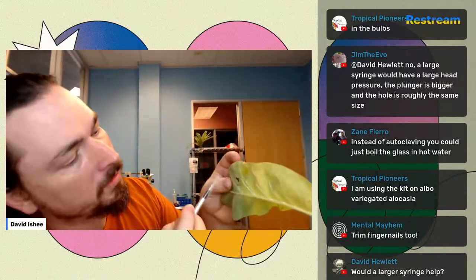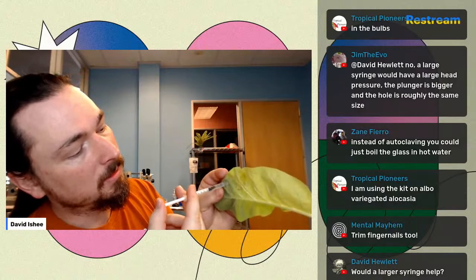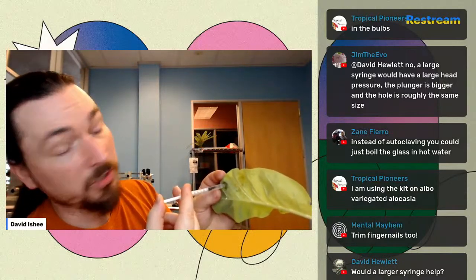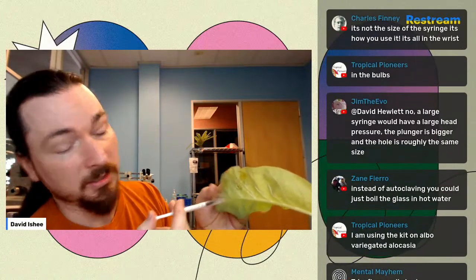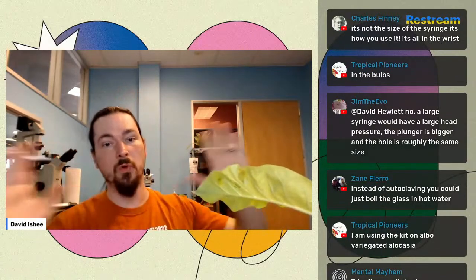But yeah, so one of the things you want to do while you're infiltrating is just be mindful of the pressure. And not all spots are the same. Some spots are just hard. They just don't want to infiltrate well. And some spots are just a lot easier, for I have no idea what reason. You just push in there and it just goes whoosh.